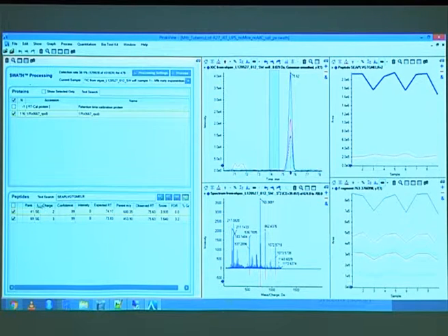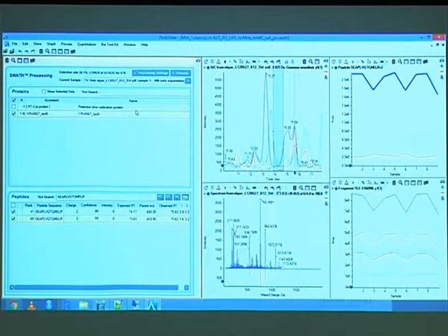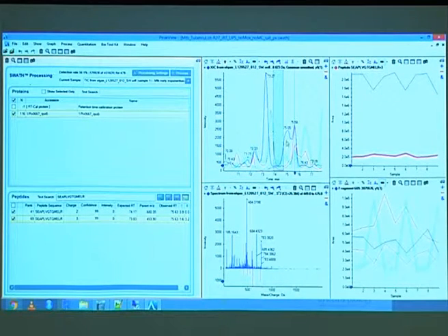But yeah, so here you already see the doubly charged one is again a nice high peak. This one, for instance, might be a candidate for these retention time normalization peptides. If you go to the triply charged peptide, you see that one doesn't look that nice. Down here, not too good. The peptide is slightly off, but you see it's only off in 3 of the samples. The other 6 are straight for the doubly charged and the triply charged.